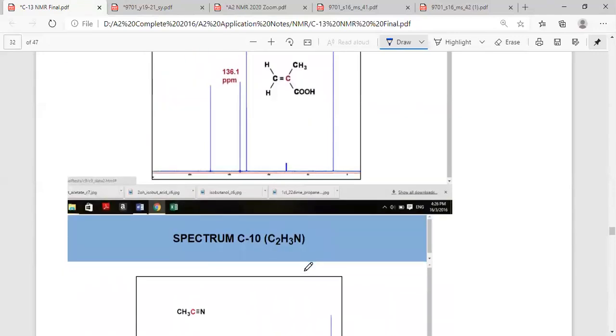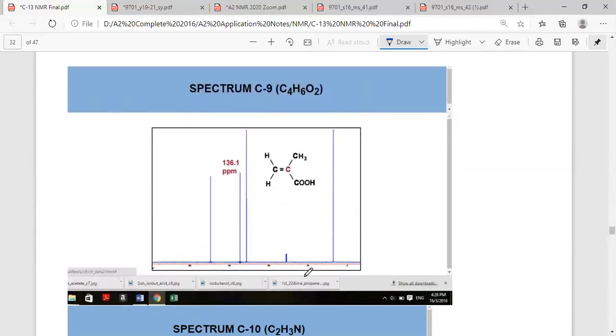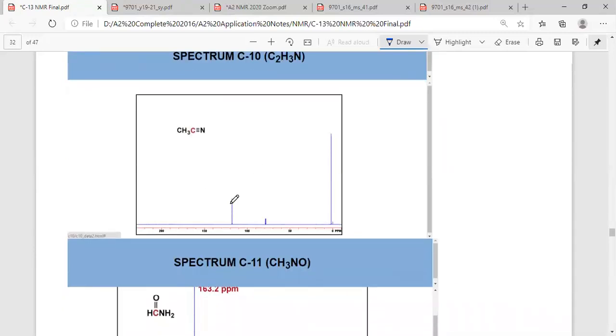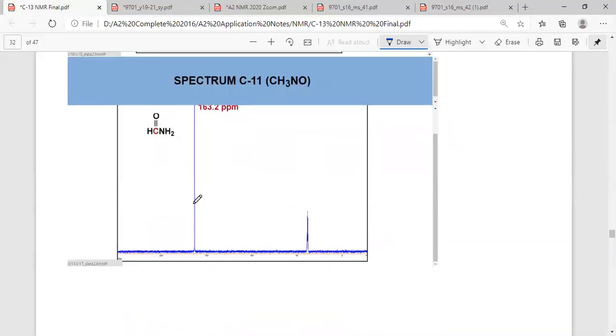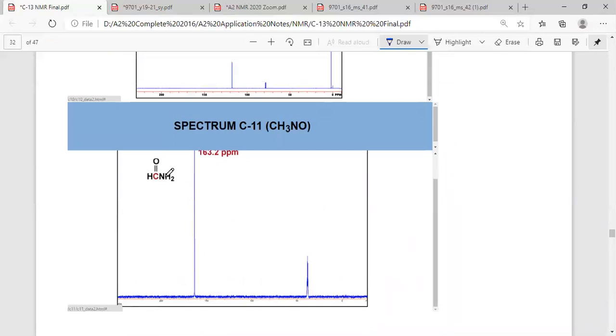Okay? Now let's look at some more here. Again, you see a double bond here. So a pair. Right? So of course this one here with the carbonyl is this one here. Okay? Now next to this one, what is the next highest? This will be this one here. This one will be this one here. Of course this one will be this one here. This is a TMS. Okay? Right? Cyanide very high. Okay? CN very high. Again, that is very high because it belongs to your amide.